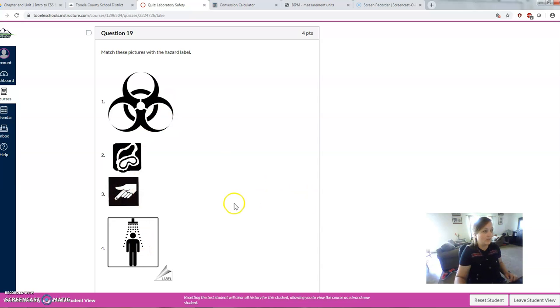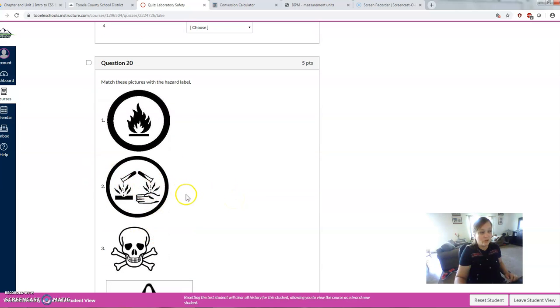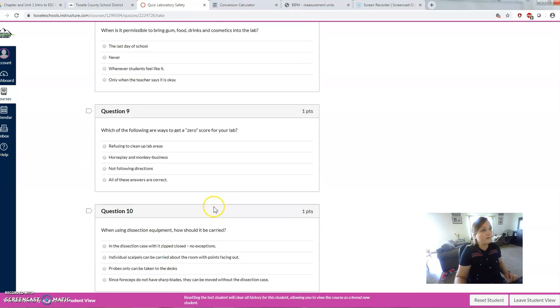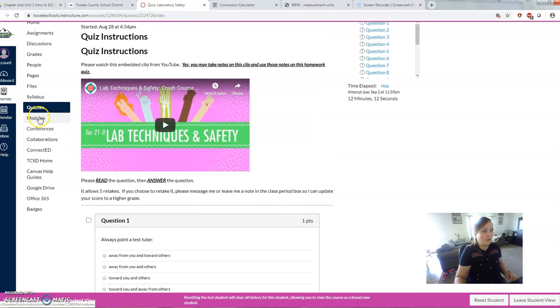This means biohazard. You will have these pictures to go ahead and match. This is corrosive, not skin irritant. This one is skin irritant, hint, hint. You'll be able to match those. If you get stuck and it's a little bit too difficult, that's okay.